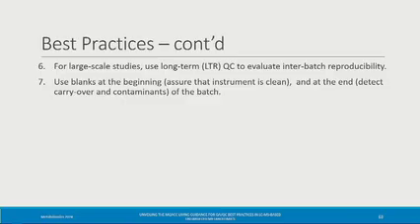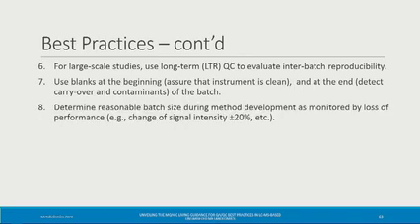Generally speaking, what we're recommending is to use blanks at the beginning. Ensure your instrument is clean before you start using it, and at the end, ensure the instrument is still reasonably clean. You don't have a lot of carryover from previous samples in the batch. One thing you have to do during your method development, again, is determine a reasonable batch size, and this will depend on how long your instrument stays stable, and it will depend on other factors as well.